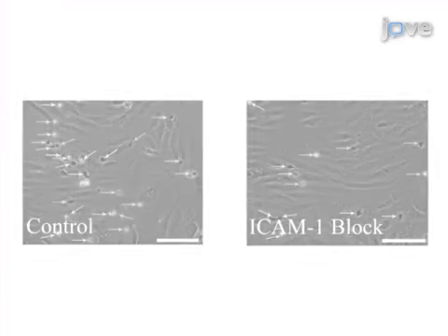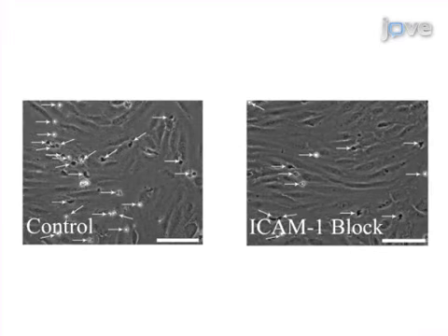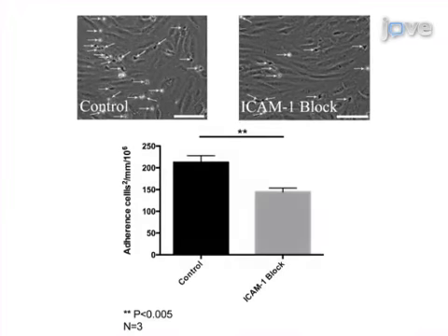Ultimately, the offline analyses of phase contrast images acquired during the flow assay are used to compare the effect of various inhibitors on lymphocyte recruitment across liver endothelial cells.